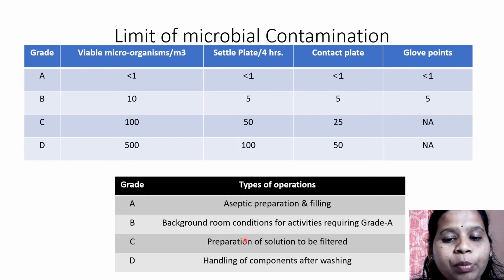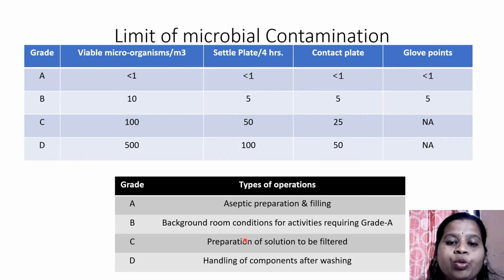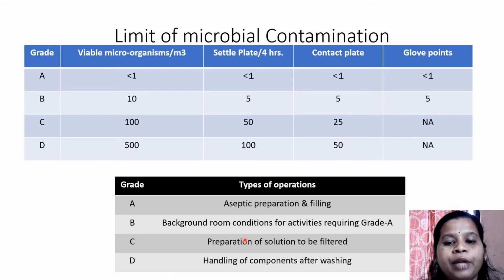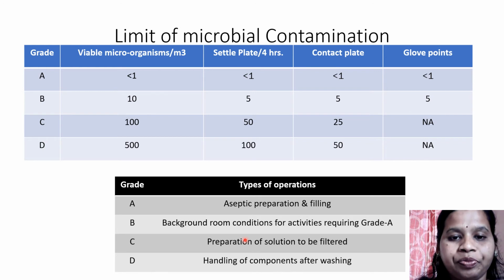Here, the aseptic processes are designed to minimize the exposure of sterile articles to potential contamination and hazards. Both personnel and material flow should be restricted to prevent unnecessary activities, in order to avoid the entry of contaminants. The layout of the equipment should be like that, providing optimized comfort and movement of the operators. The number of personnel in an aseptic room should be minimized.